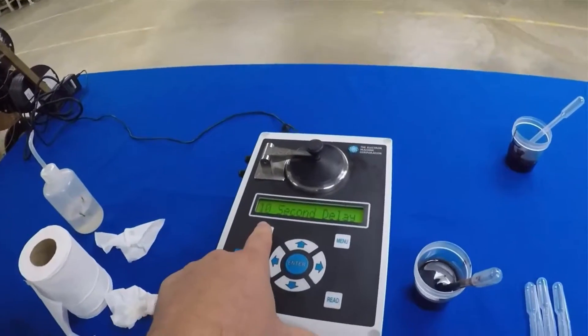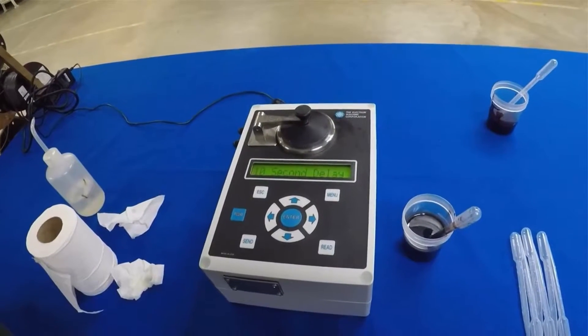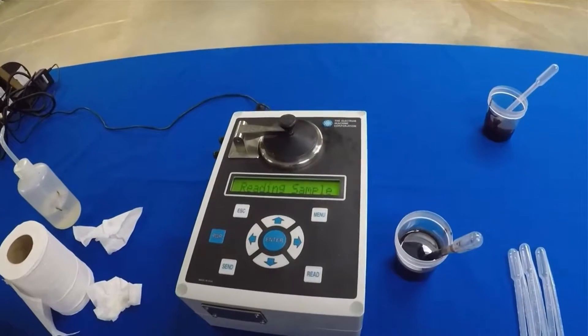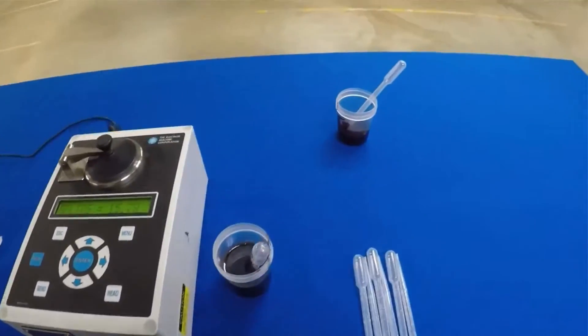You squirt it in there, give it a little stir, and close the lid. Then you push the read button — we have a self-built-in delay and this is going to give you a stable reading. This is a 15.78 sample. I would expect that from a weak liquor.